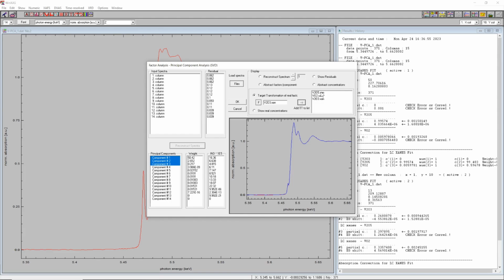So this is basically, or this is normally the end of the factor analysis. We have determined the number of references necessary for quantification, and we have, based on our database, identified this number of references, so chemical identity species that we can use now for quantifying those mixtures, those phases in each individual spectrum of our series of experimental spectra.